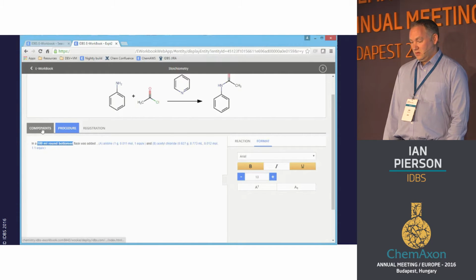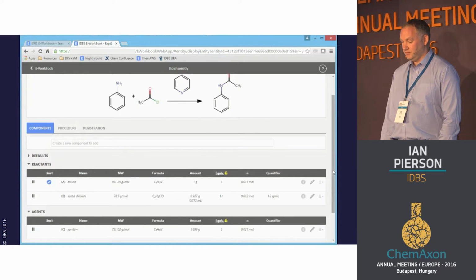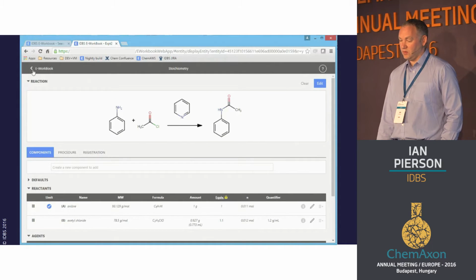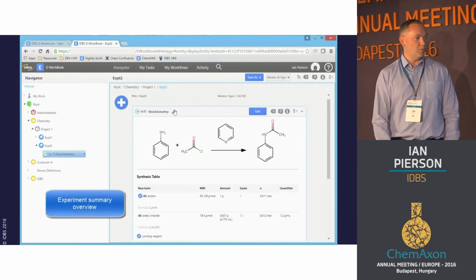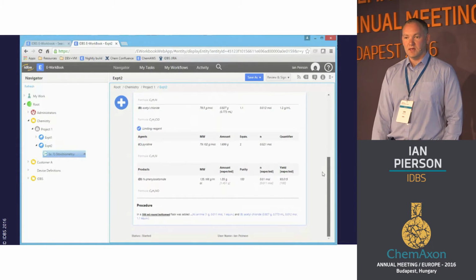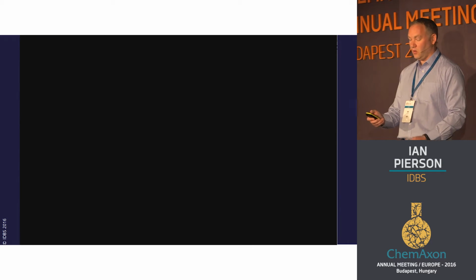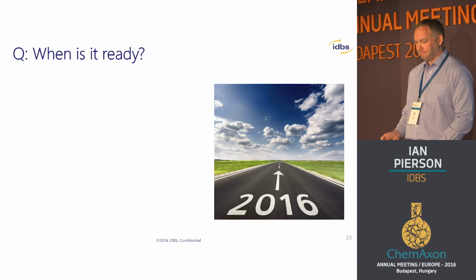And as I then return back into the system, I will then close the stoichiometry frame and return to E-WorkBook. What this gives me is a preview here, which I can then print out and I can take into the lab and put next to my balance and then actually start my weighing out of my experiments.